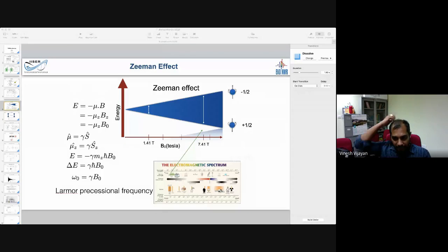Dr. Subin Kumar asked, can you give an idea about NMR spectra other than 1H and 13C? There are, of course, 31P and 19F, fluorine NMR and phosphorus NMR. They are both spin half. The chemical shifts are going to be different, but the idea still holds. Fluorine is a highly electronegative atom, but it can still show very good chemical shift differences. I do not know the exact range of these chemical shifts, but one can easily find out from Google. The same idea holds. It's spin half, so it's very easy.